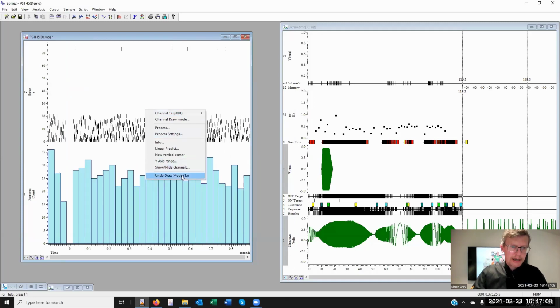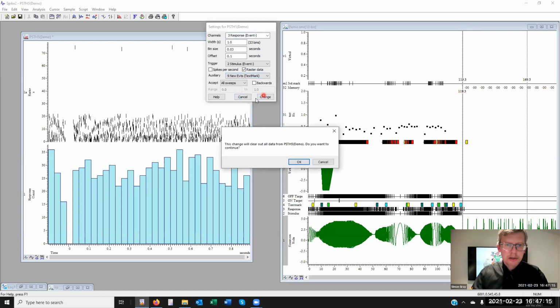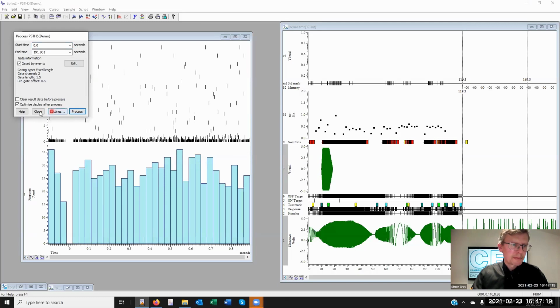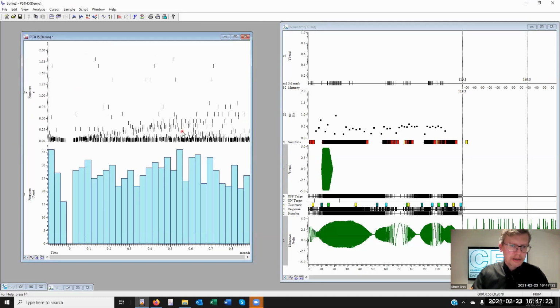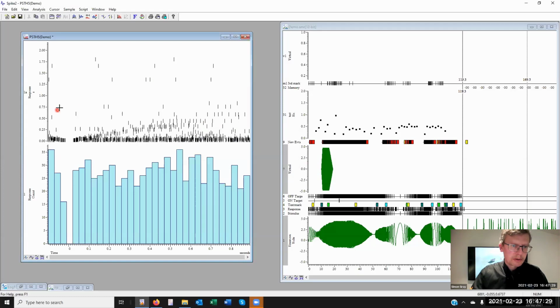I know why. Let's just change it to 9, which it should have been. Change, okay, and process, close. Now we should start seeing something. Channel draw mode, sort 1, okay.